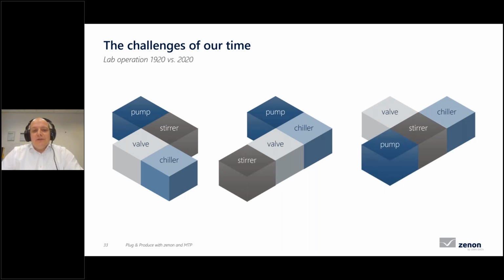Modularization based on MTP was the game-changing technology here. The goal was to enable the lab technicians to integrate and automate the required modules themselves and with no need of programming knowledge.